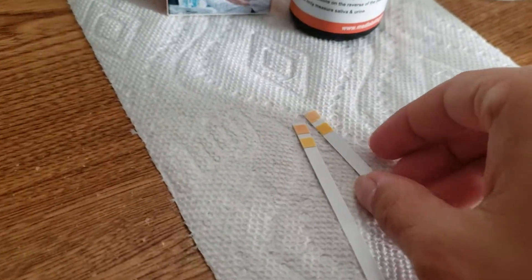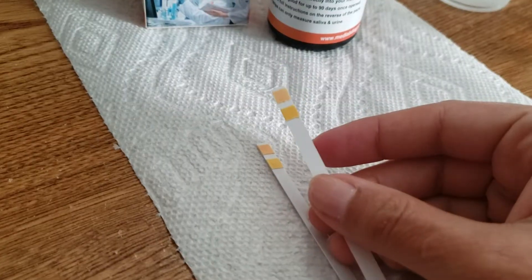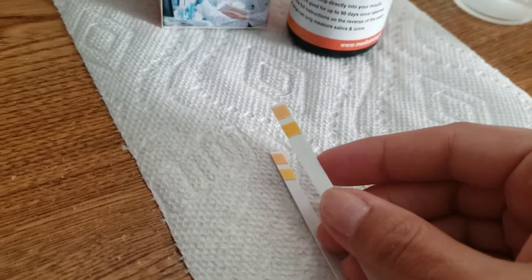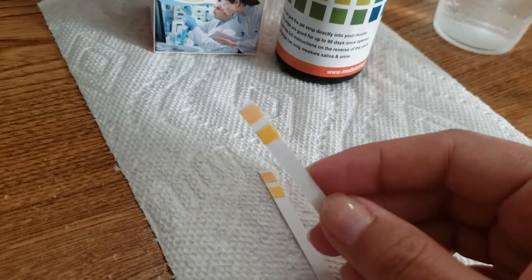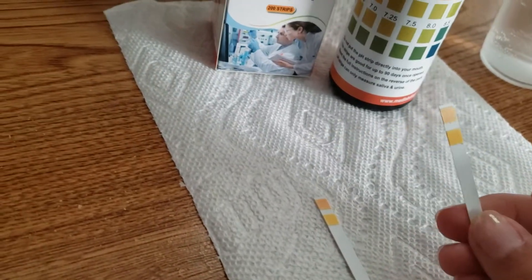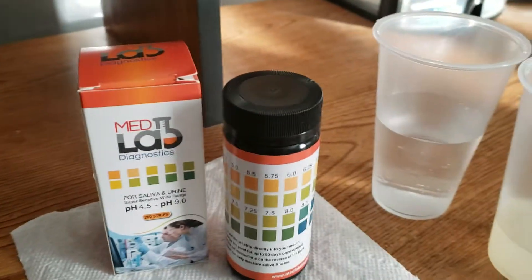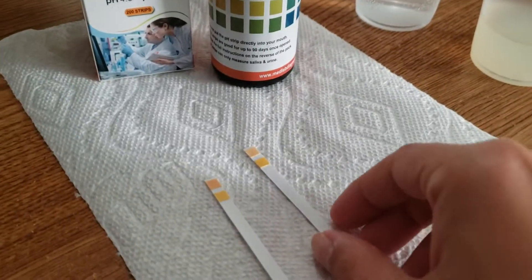When you take out the strip, you can see that it already has some color on it. It has a light orange color to it, and that's normal — that's how they look when you take them out. So we're going to go ahead and dip the strip and see what we get.